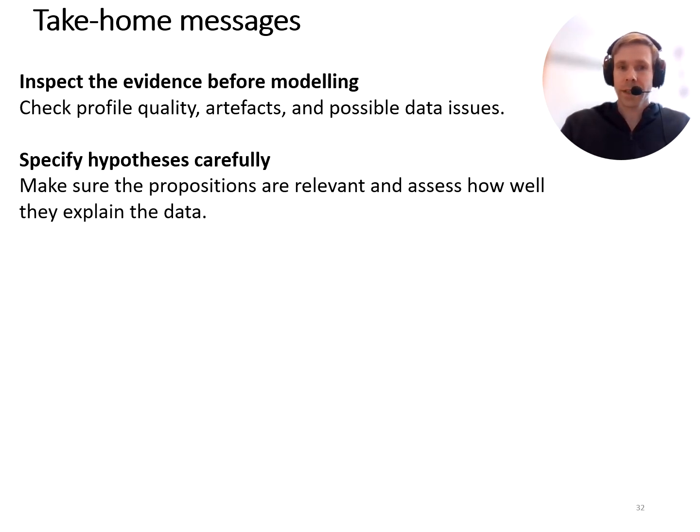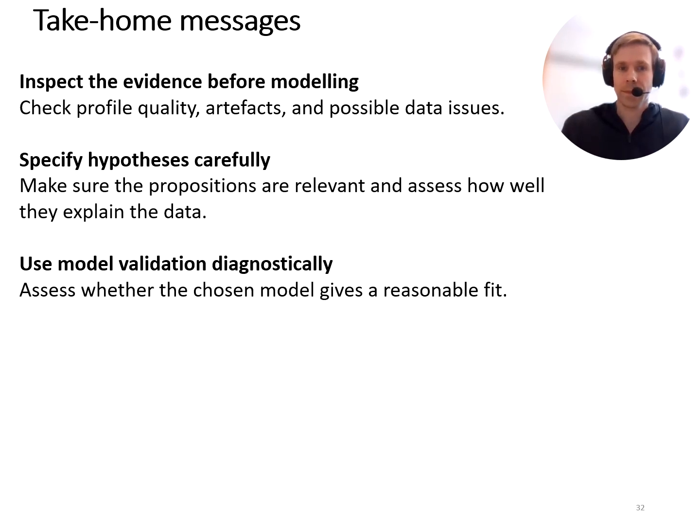When you come to defining the hypotheses, define these carefully, make sure they are relevant for the case, and assess how well they explain the data. Also, for the model validation, use it as a diagnostic tool and see if it gives you a reasonable fit to the data.